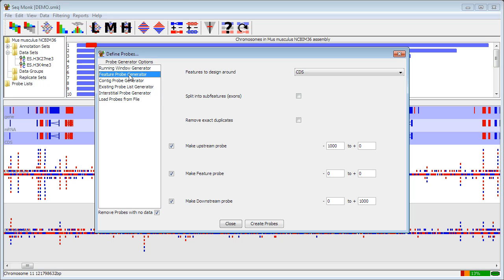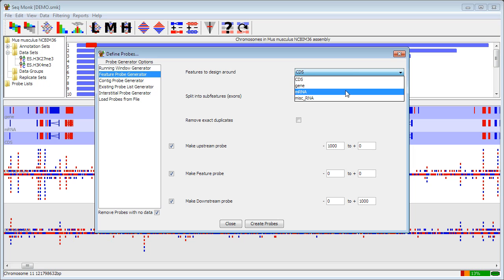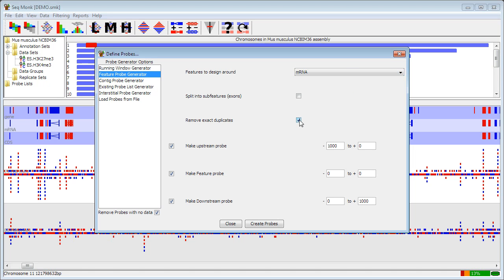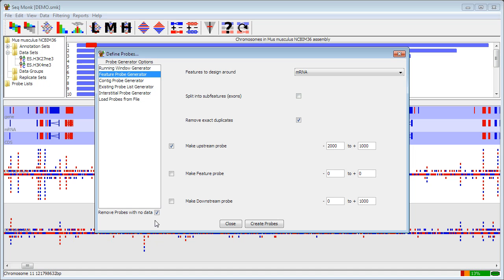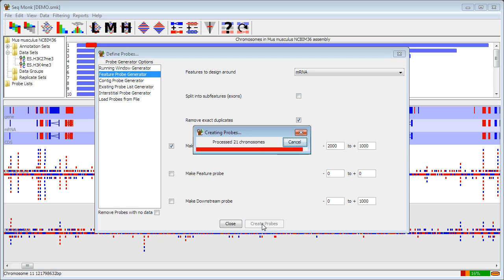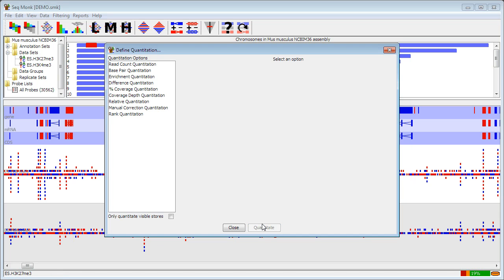In our case, I'm going to make probes over promoters. So I'm going to design around mRNA features. I'm going to remove duplicates in case I have two promoters in the same position. You can make up to three probes for every instance of each feature. In this case, I'm only going to make an upstream probe because I want the promoter region. And I'm going to make it from 2000 base pairs upstream of the transcription start site to 1000 base pairs downstream. And I'm going to untick the little box that says remove probes with no data because I want to have something for every promoter in my genome. OK, my probes are now created.